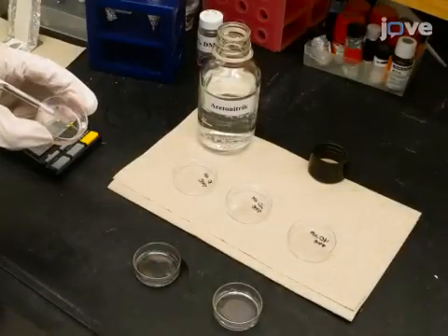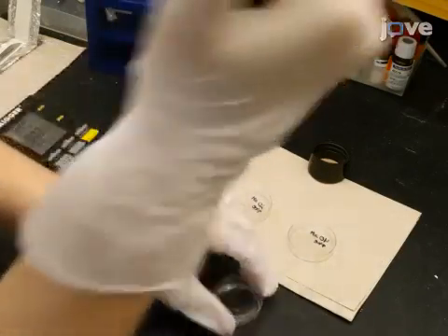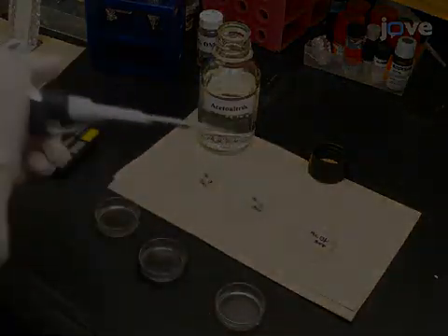Next, add 4 microliters, 6 microliters, 8 microliters, 10 microliters, and 20 microliters of a 100% solution of acetonitrile.